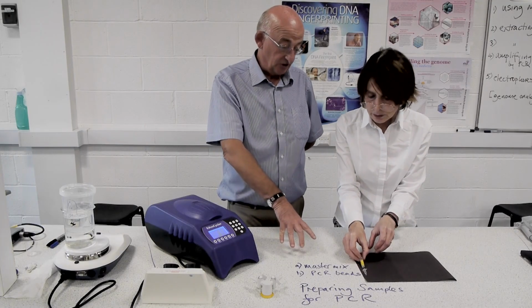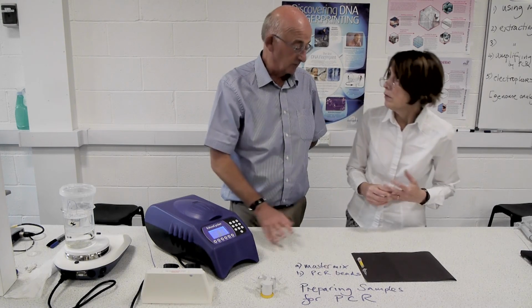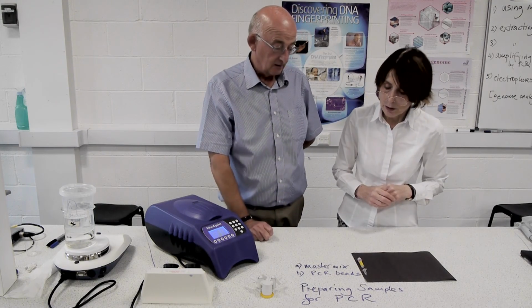So I think that's just down to personal circumstances, isn't it? Whether the beads or the master mix is an option for your group. Basically, you make your choice.